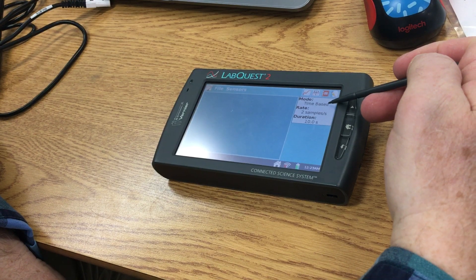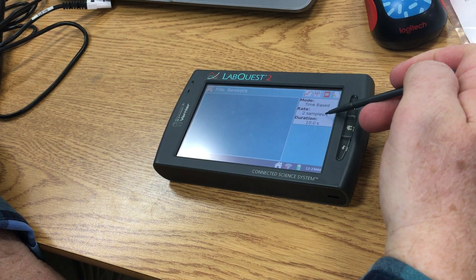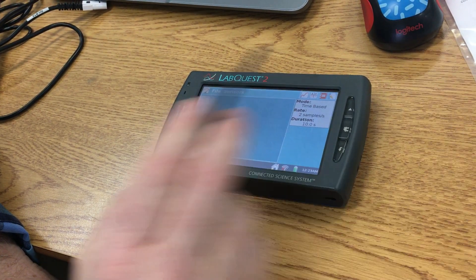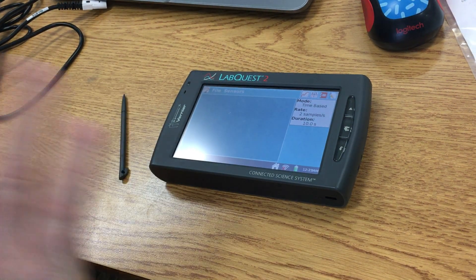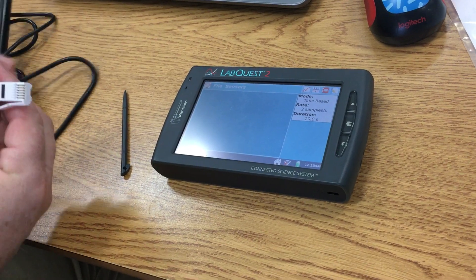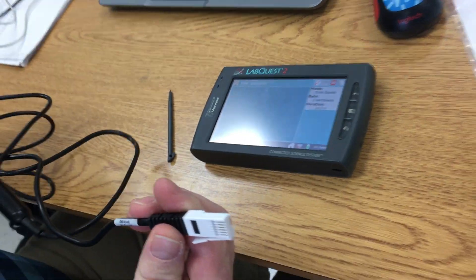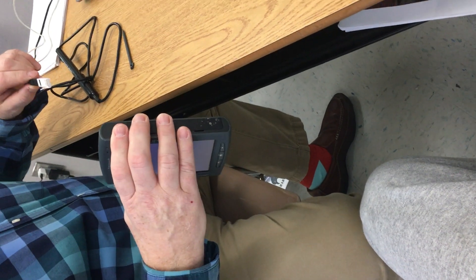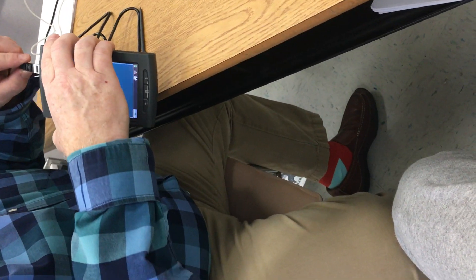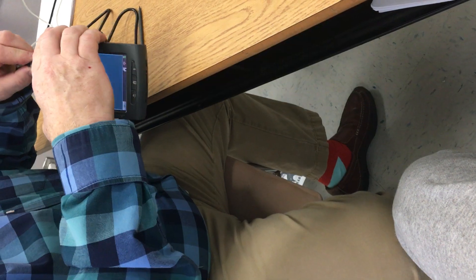Then you've got Time Based, two samples, and then 10 seconds. We're going to need to connect our sensor to this port right here. We're going to connect it to the channel one port, so we're just going to flip it in and connect it.